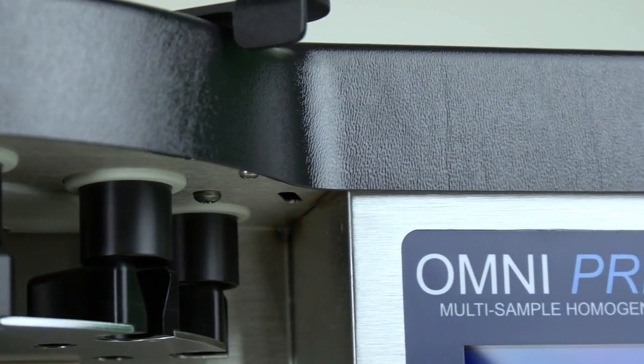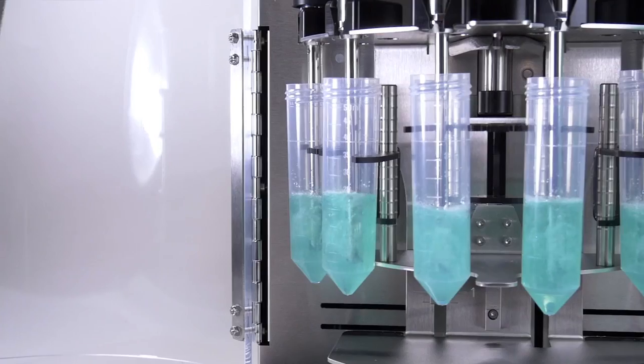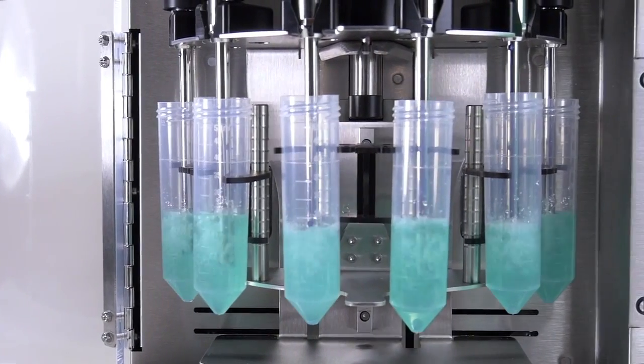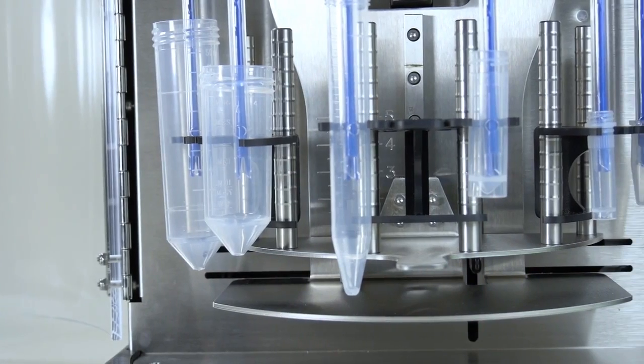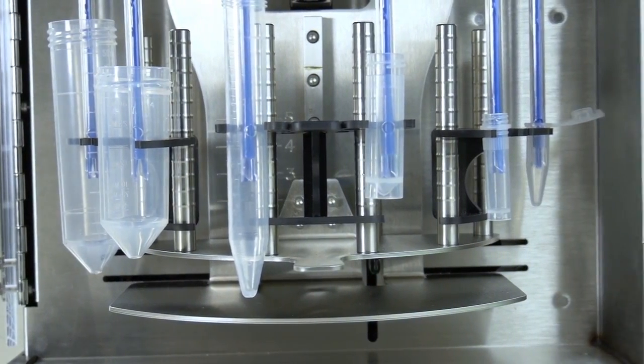The OmniPrep 6 is an automated homogenizing workstation that can simultaneously process up to 6 samples per cycle in volumes ranging from 1.5ml to 50ml.